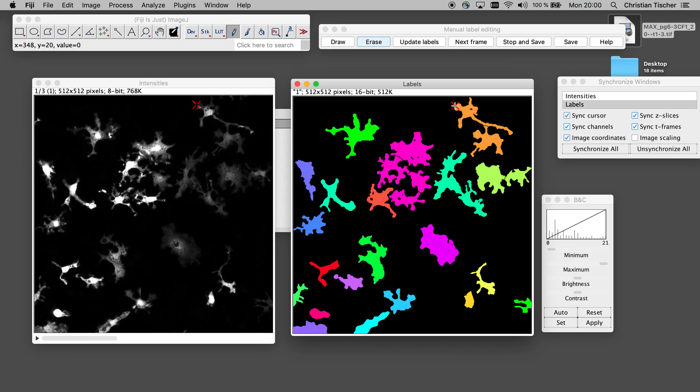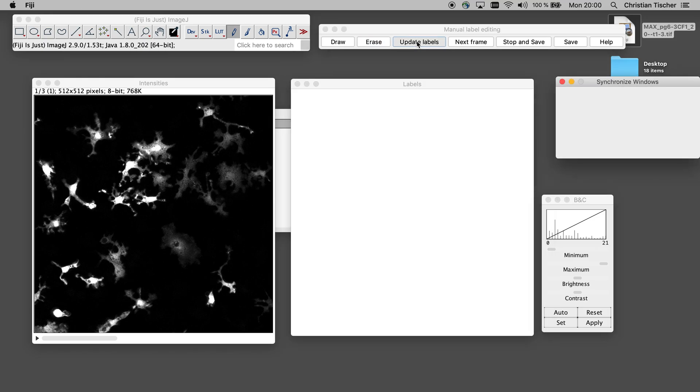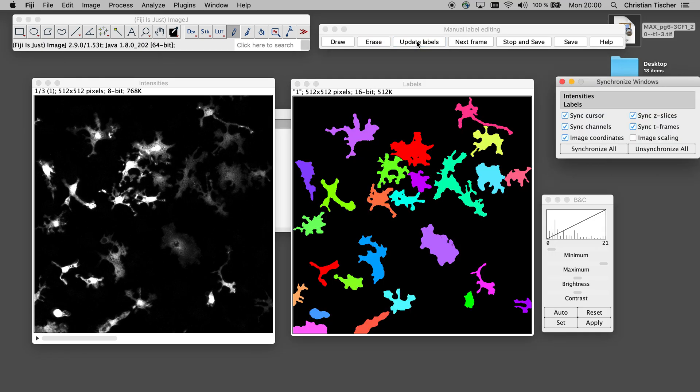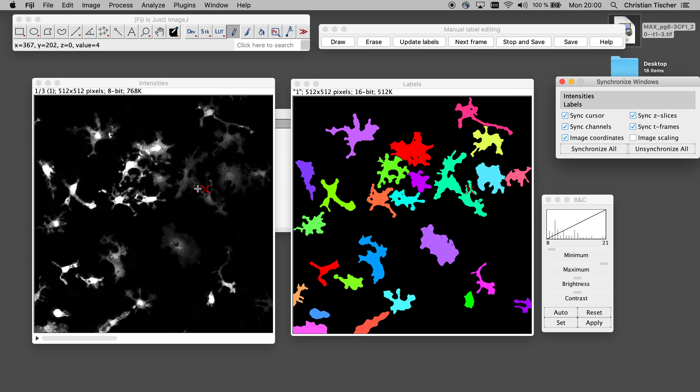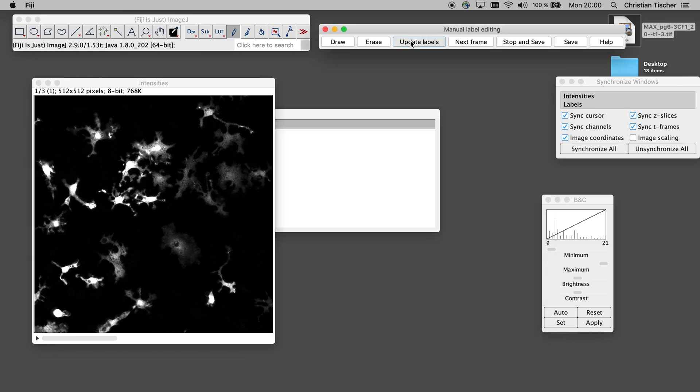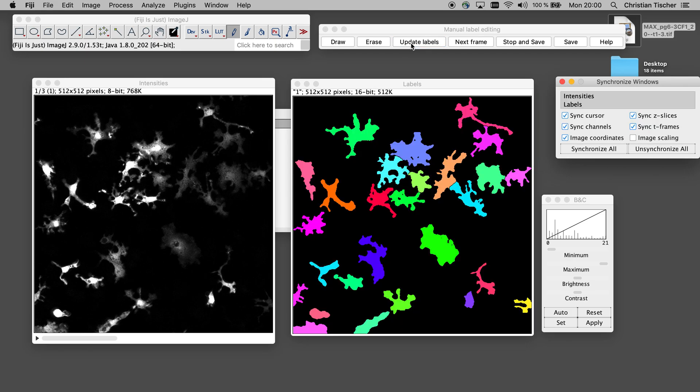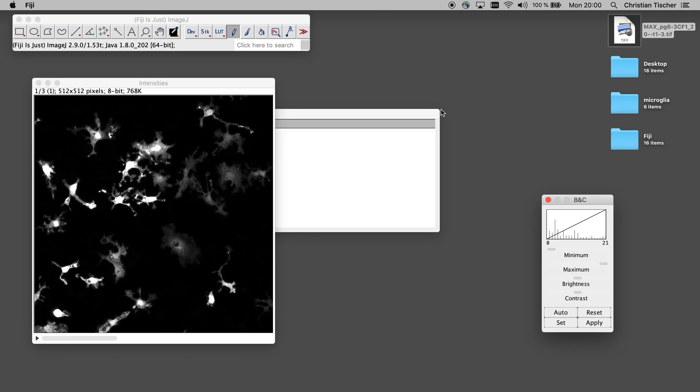I will not correct everything now. I just want to show the functionality. So if you now click update labels, you see the new label mask with the split cells. Okay, here is another one. So let's also click that one. Labels. Okay. Let's say now we are happy. Then we could go to the next frame.